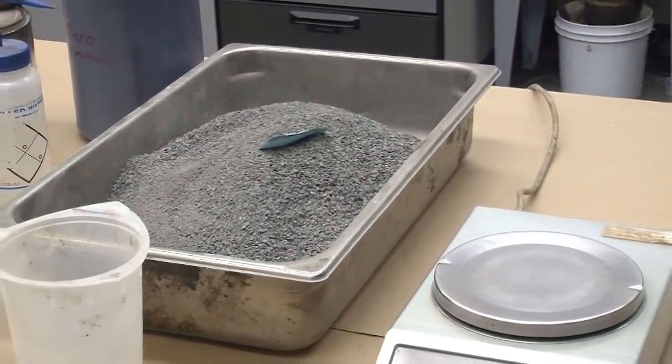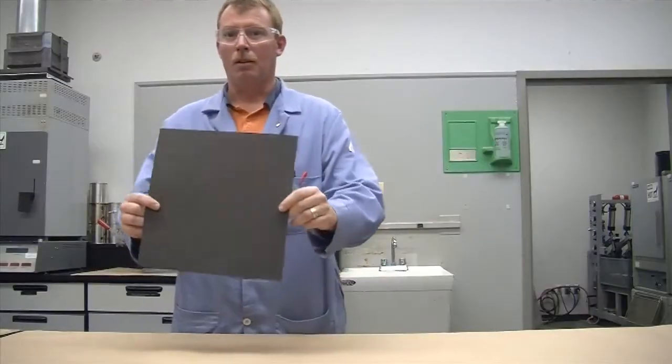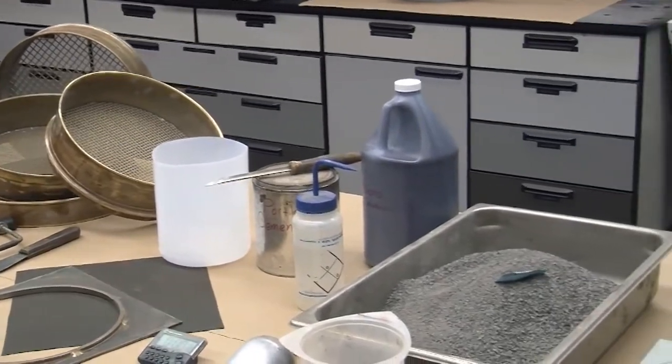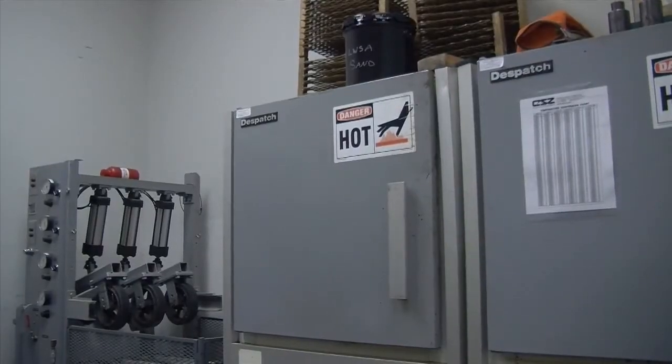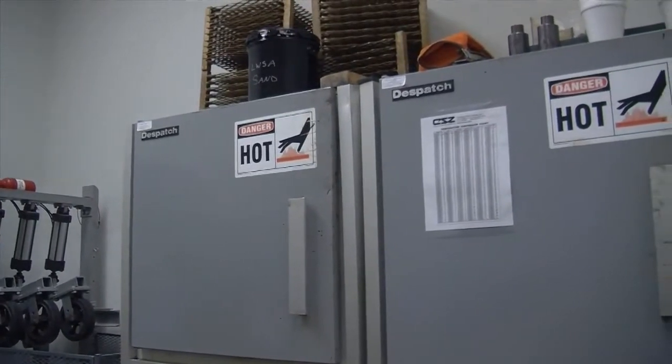Additional equipment includes a flat-bottom metal pan, a plastic bowl, a suitable mixing spoon or spatula, 30-pound roofing felt paper, a specimen mold, a mold strike-off apparatus, and a forced draft oven controlled at 60 degrees Celsius plus or minus 3 degrees Celsius.